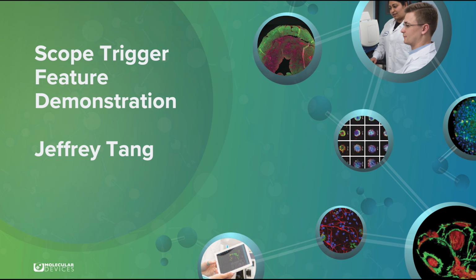In this video, I would like to show you one of the useful features in Clampex. That is called scope trigger.